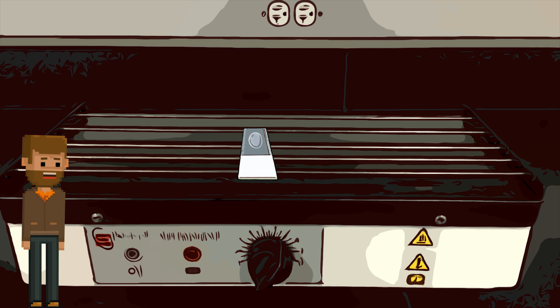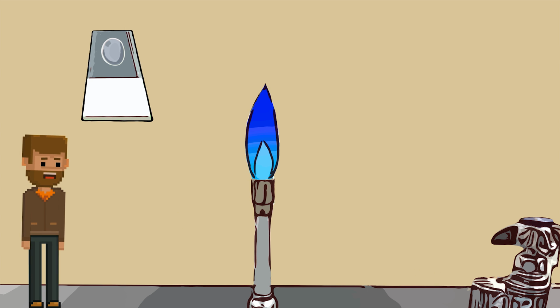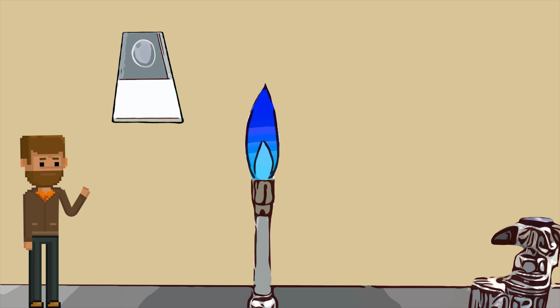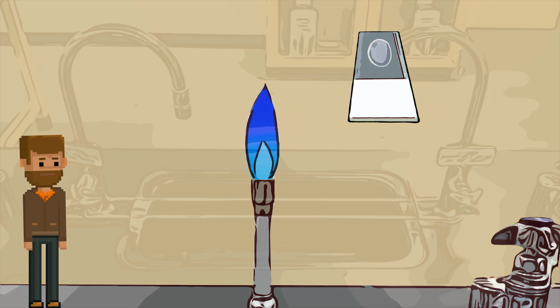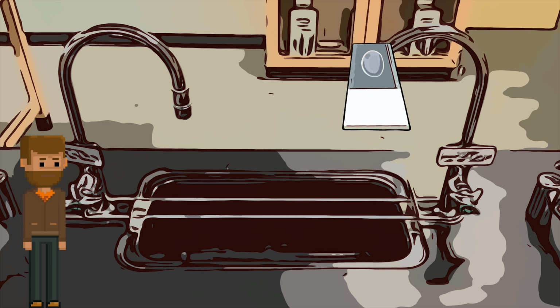Once your slide has air dried completely, you'll finish prepping the smear by heat fixing it. This step is really easy. You're going to use your Bunsen burner and you're going to pass the slide over the tip of the flame a few times. I always count to 3 while I'm passing it over the flame, because it really doesn't take much time to heat fix a slide. 1, 2, 3. Done.